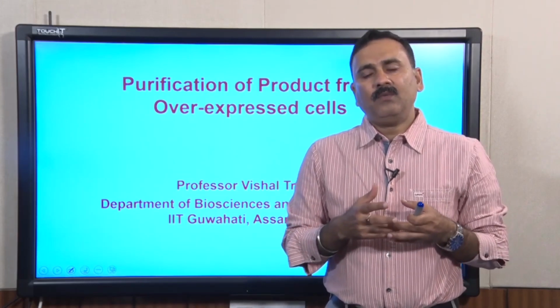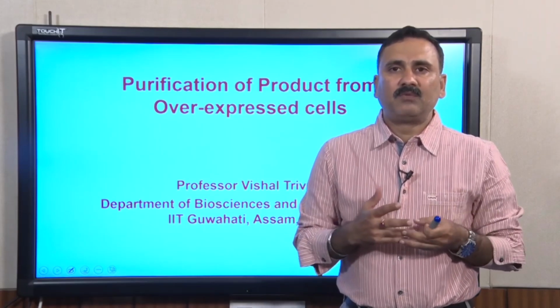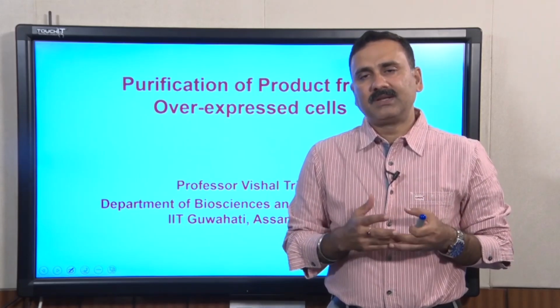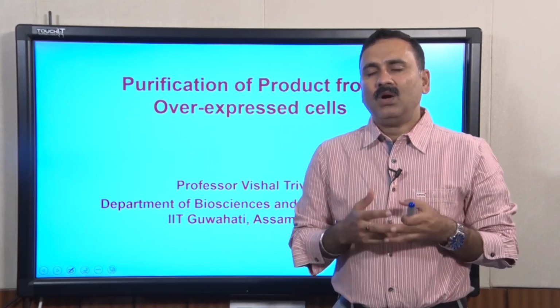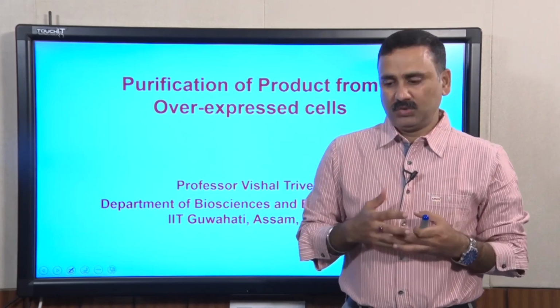And now in this lecture we are going to discuss the different types of chromatography techniques. So, in this series, before we get into the details of the chromatography techniques or chromatography approaches you can use to purify the proteins, let us see what the different properties present in the protein molecules are.